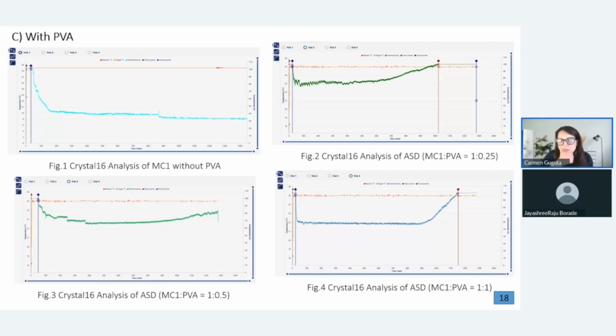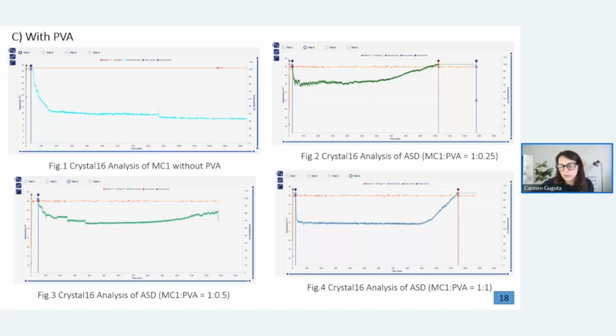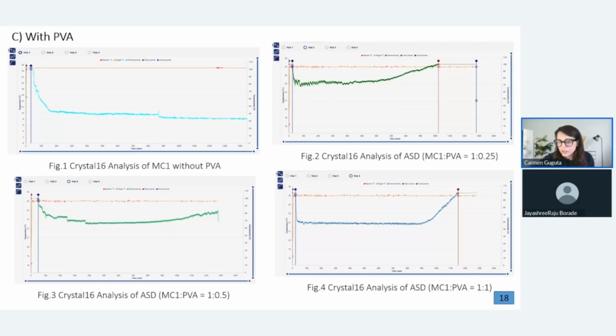So you would always look at all strategies, co-crystallization, amorphous solid dispersion, everything, to cover from an IP point of view, of course. And definitely, if you are working for a generic company, you have to cover all these and see what are maybe missing points that were not covered, and think out of the box to try to cover all the landscape.